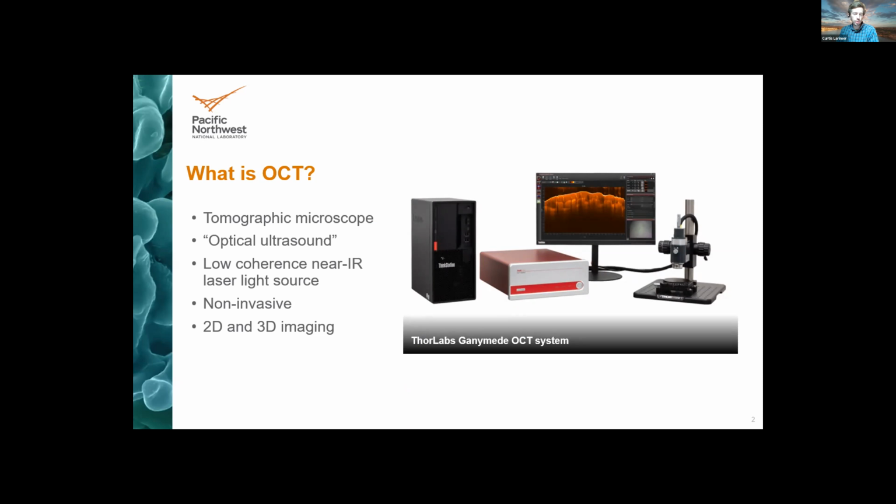It's pretty easy to move around, so if you have a sample that's already set up in EMSL in one particular lab, we can usually bring this imaging system to you. And we've even done things like taking the imaging end, which is on the right side, and fish that through a port into a growth chamber or something like that.